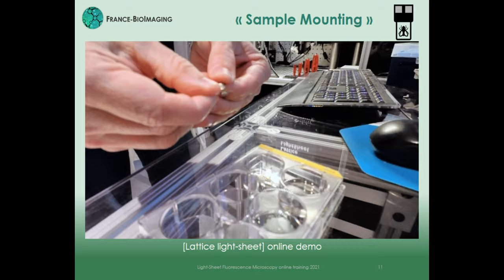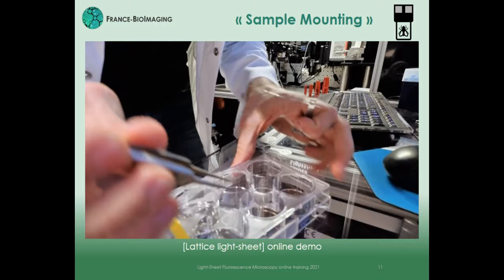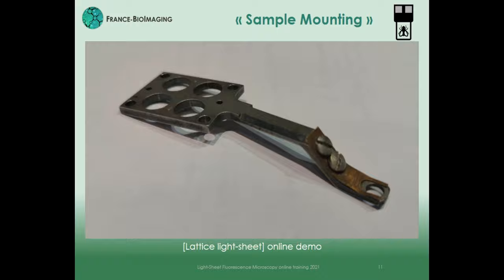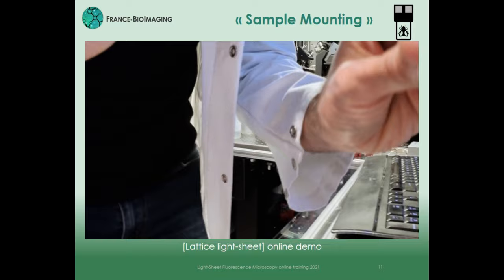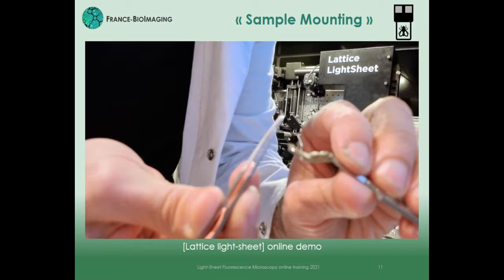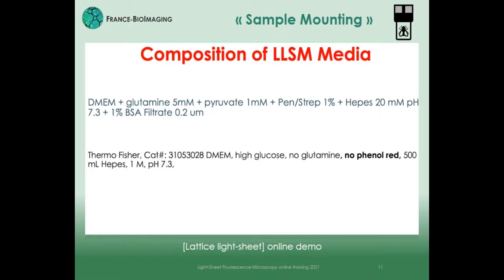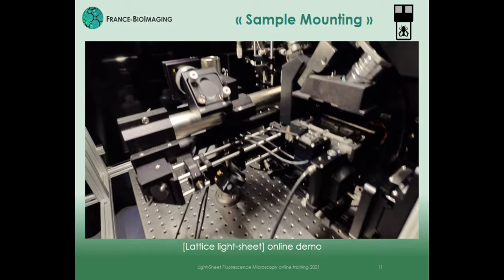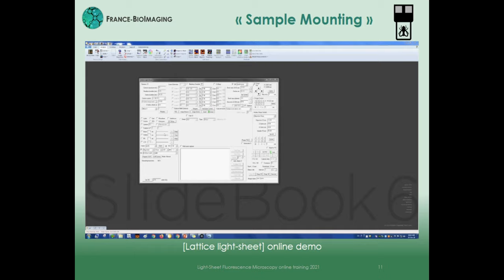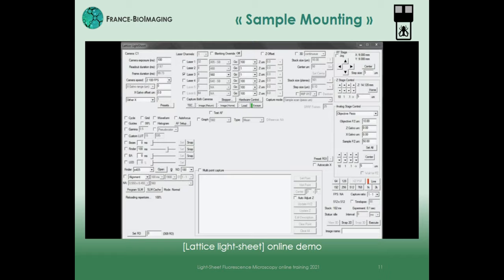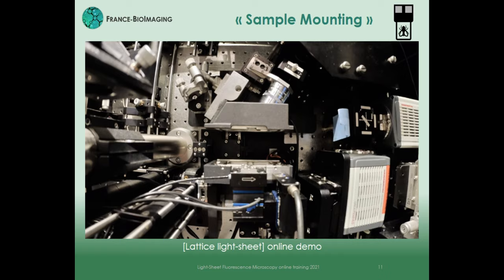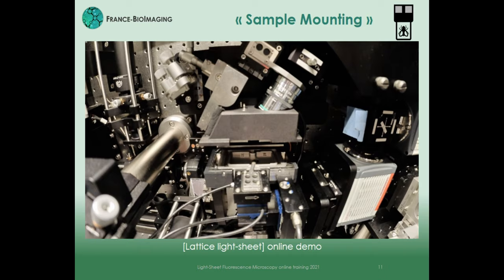Let's insert the sample. After a last wash in fresh medium at 37°C, the coverslip is recovered and delicately placed in a sample winding support, specially designed to avoid the use of silicone grease while safely maintaining the seal. Finally, the support is introduced into the sample chamber of the system, filled with the lattice light sheet microscope media used for the previous calibration step. A dedicated tool with screws ensures the stability of the overall mounting and its solidarity with the stage. Positioning of the sample stage and reinitialization of the XYZ stage to a neutral home position is automatically driven through the acquisition software.